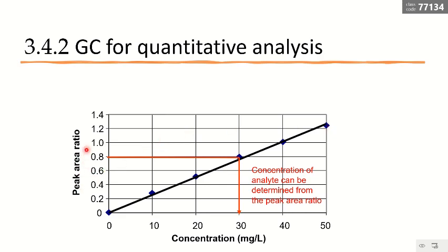I have the peak area ratio. Basically, I have my analyte inside and my internal standard inside, and I have the peak area ratio. They increase proportionally, so this curve we can call the standard curve. Then I have another sample using the same method. If I have the peak ratio analyzed as the result, then I can use this graph, this plot, to deduce back how much is in my sample. That is the concept.